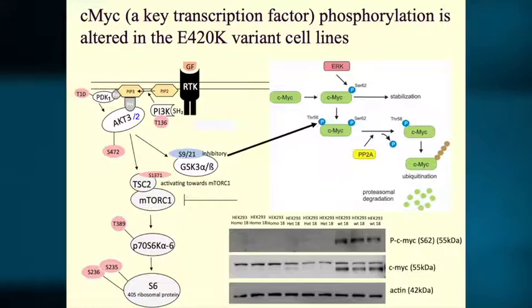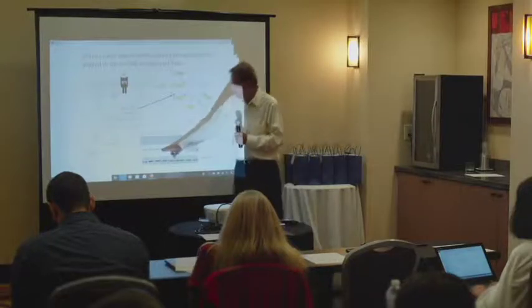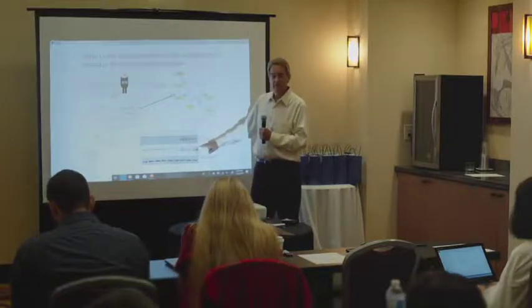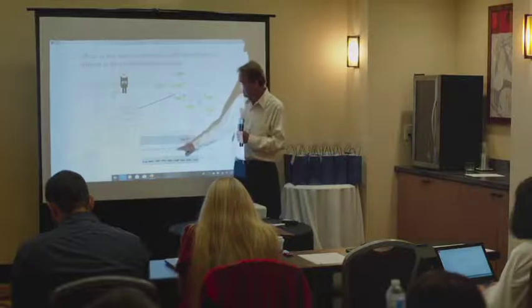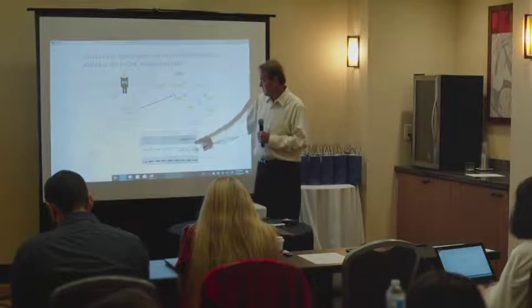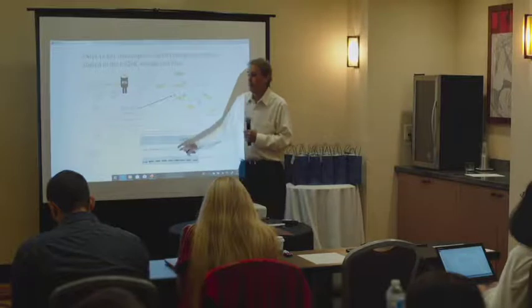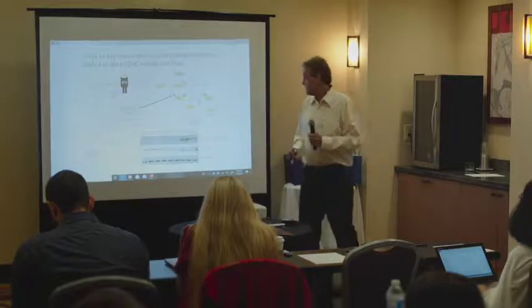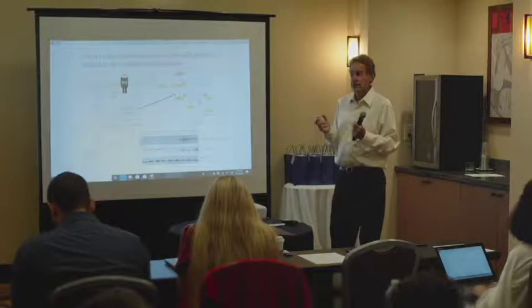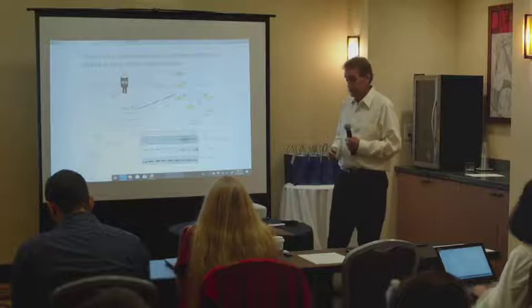And so with the MYC antibody itself, we actually have two bands. And again, this is the wild type and the homozygous. And we're not sure what this upper band is. If it's MYC, then we're having a change in the size. So there's something that's being physically changed. If it's just a nonspecific band, then we're seeing a change in the MYC protein levels as well. And so this is a new avenue to explore. And this actually fits a lot of the proteomic data. There are a lot of proteins that go up that are probably regulated by transcription.